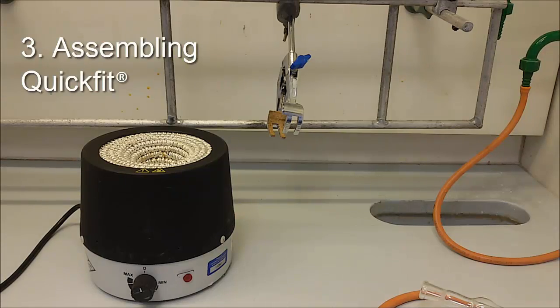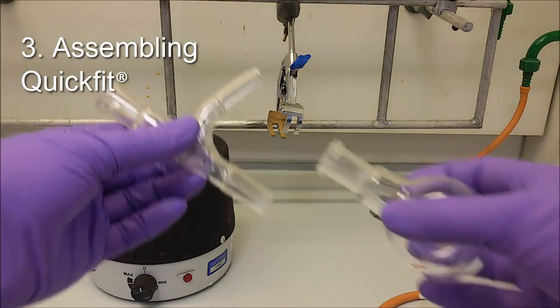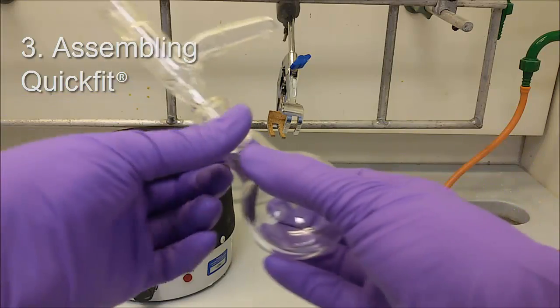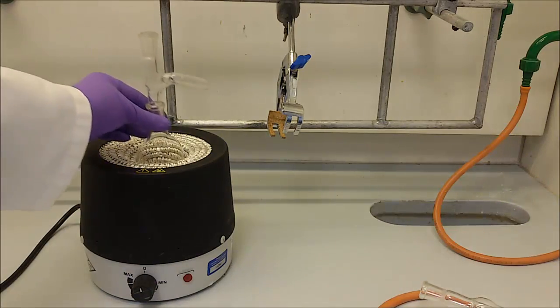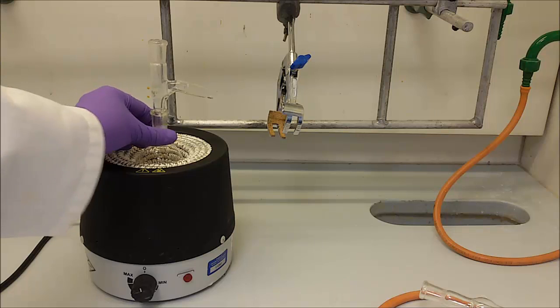Take a 50 ml round bottom flask and fit to the right adapter. Place them in the heating mantle and convince yourself that the mantle gives a firm stability to the flask.